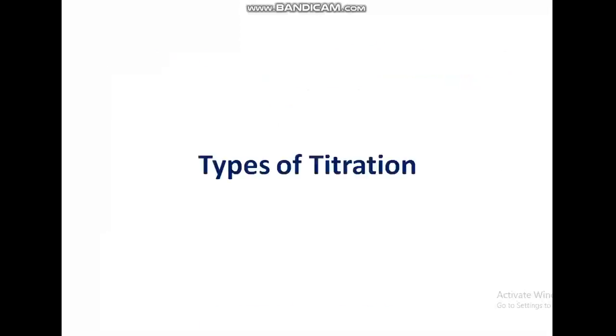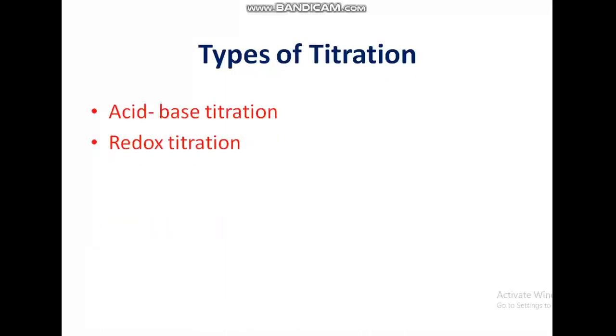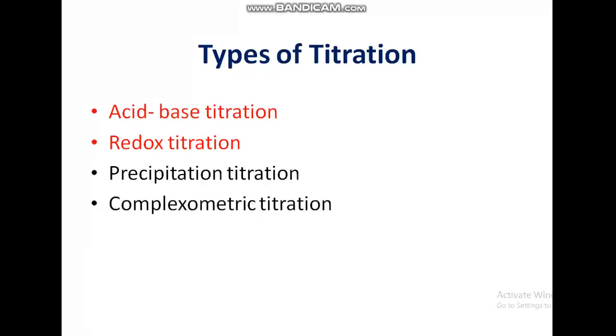Types of titration. We have acid-base titration, redox titration, precipitation titration, and complexometric titration. All these types of titration involve the same technique, which we shall learn in this training. SSCE focuses on acid-base titration and redox titration only.